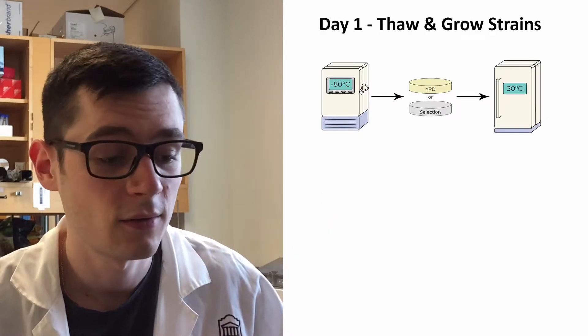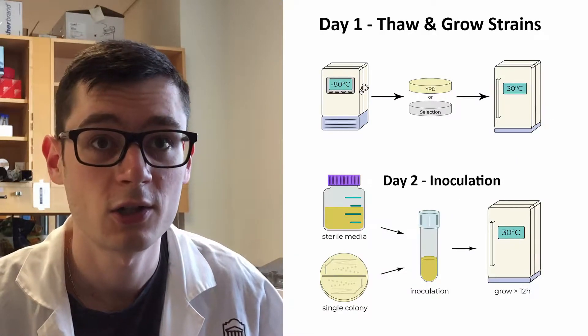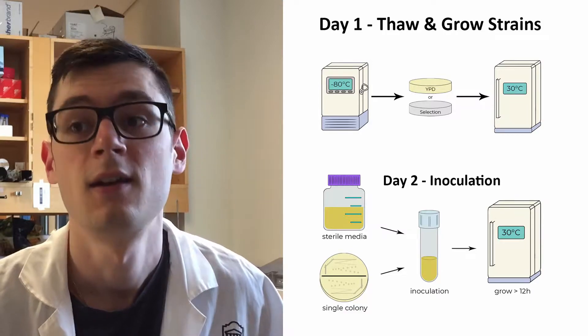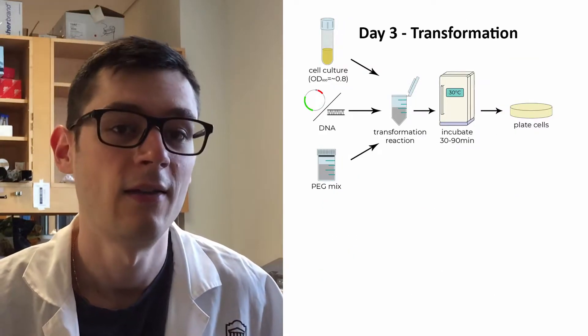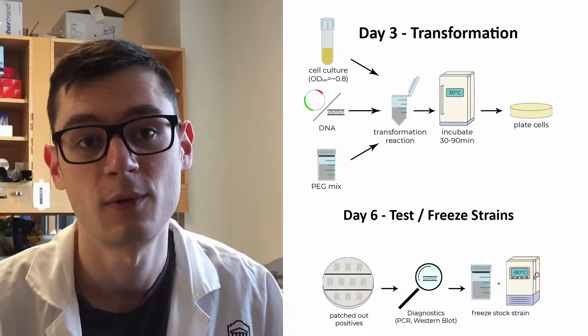We're gonna get some strains out fresh, make a fresh inoculation, grow up some cells for the next day, do the transformation, and then test the strains before freezing them.